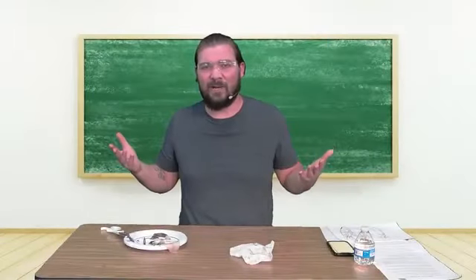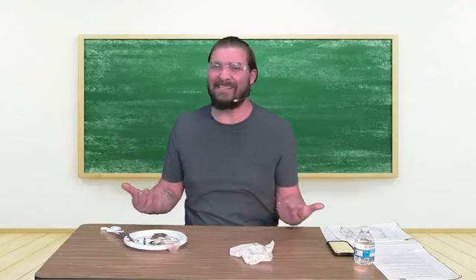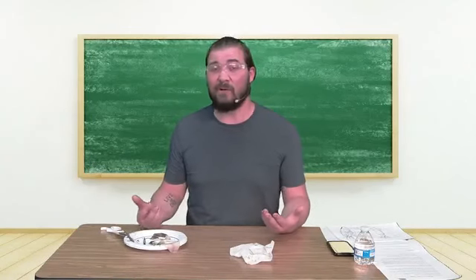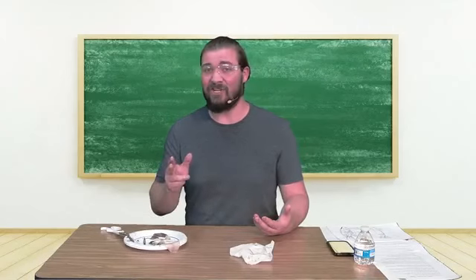So we've dissected the squid. It wasn't that hard. It's a little gross, but once you get into it, it's like anything else. You get relaxed, you get comfortable, and you can learn a lot from stuff like this. Highly suggest cooking it. Don't waste it.